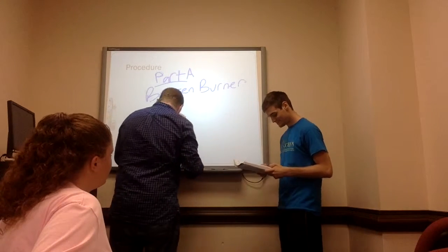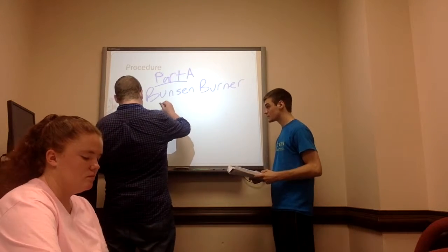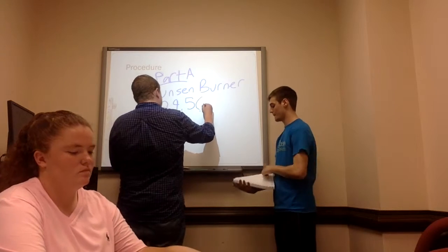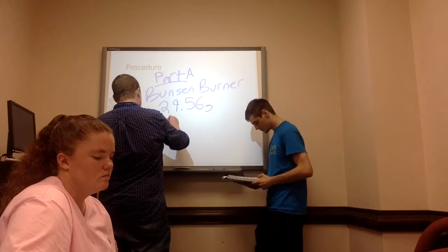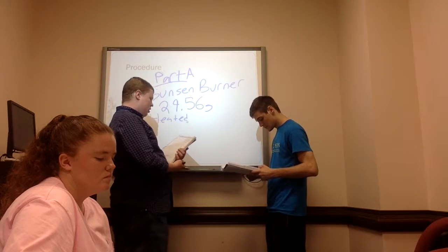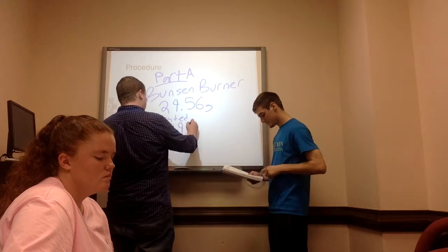That's good. And you let that cool down, and your post-drying weight was 29.56 grams, correct? Correct. And so then you heat it again, and you said that after that cooled, your mass was also the exact same, 29.56, right? Right.